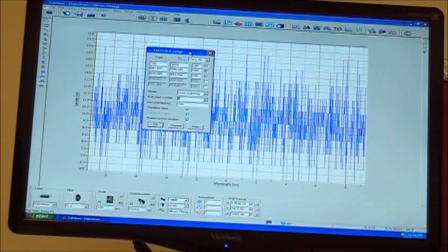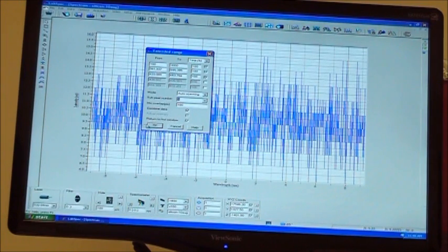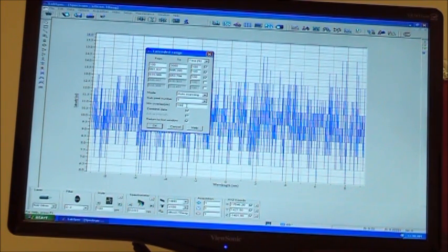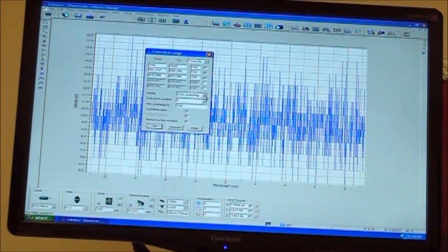4 hours. Then if you set in the autofocus with that too, your map now takes 27 hours. And it keeps building and building and building. And in here is the minimum pixel overlap. We always recommend you leave it at least 100. That's for when you do the actual multi-window mode.